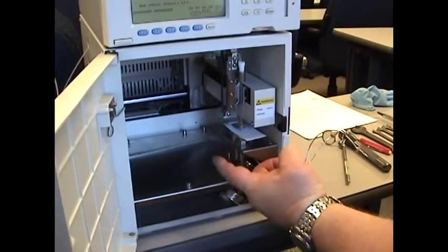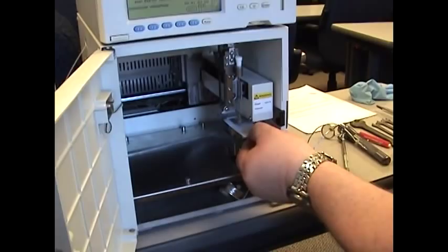You also want to make sure that the X and Y directions are clear. Use a dental mirror to check the Y direction.